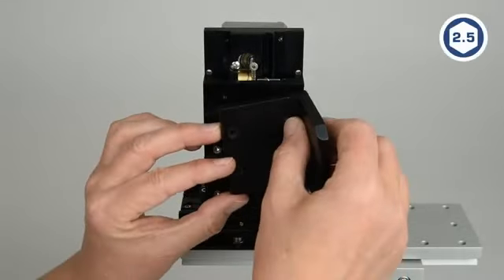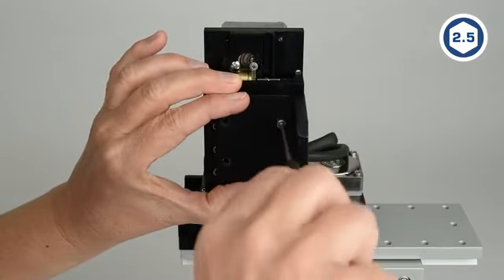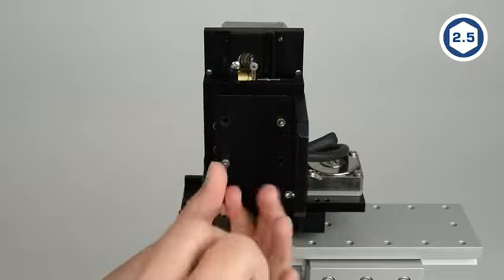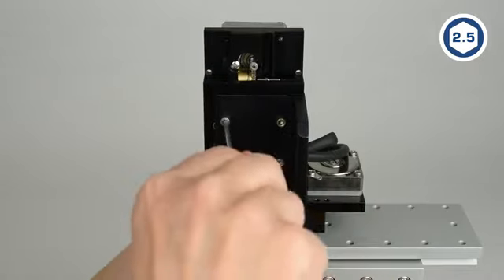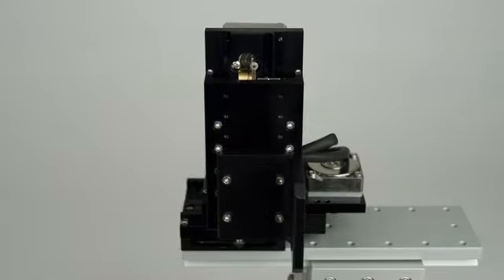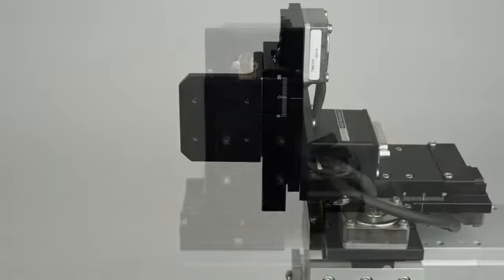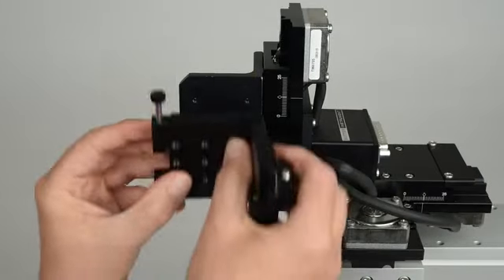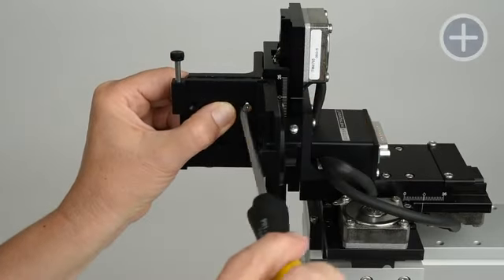Use an M2.5 Allen wrench to attach the right angle adapter to the manipulator in the same place as the swing gate with the provided M3x10 socket cap screws. Note that if you need a steeper or shallower angle, the adapter can be mounted lower or higher on the Z-axis slide. Now, rotate the manipulator 90 degrees clockwise. The swing gate then attaches to the right angle adapter using the Phillips screws.